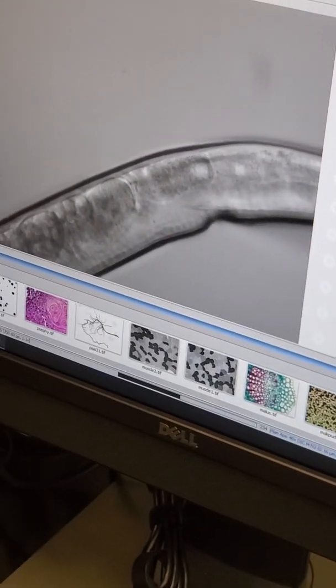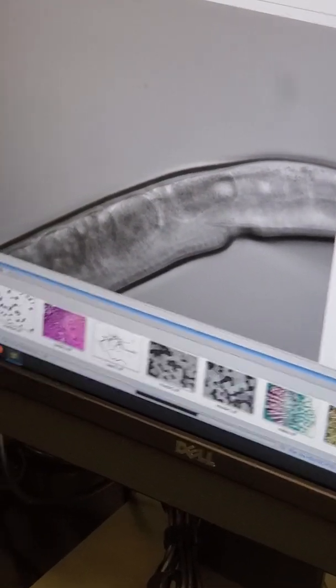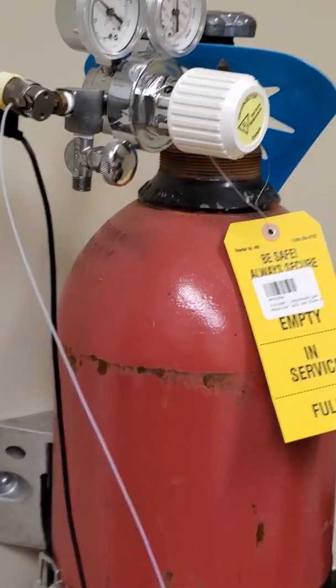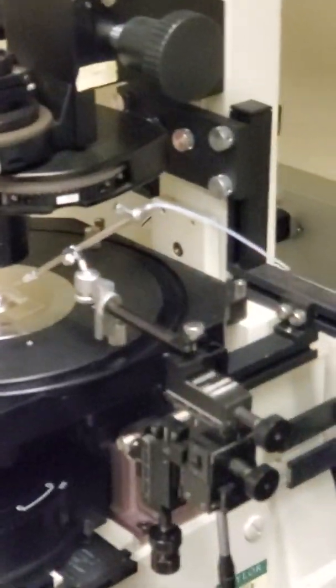So the way that we are injecting the liquid is through our foot pedal here on the table. You can see Josh's foot on it right there. And so that is connected to our nitrogen air tank. And so that pushes air through our tubing, which connects to the back of our needle. And the air then pushes the liquid into the worm.